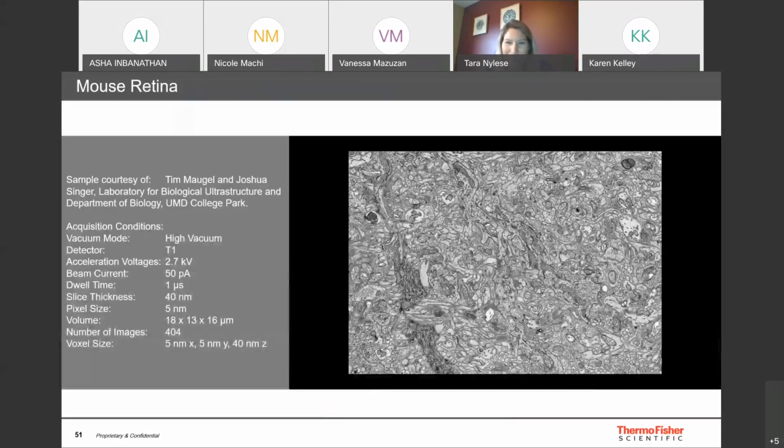Oh, I'm sorry, unless you squint now. Normally I have a zoom in, but it looks like that didn't activate. So zooming in onto the area, you could actually see the ribbon synapses that are really down at the 5 to 10 nanometers size for those features themselves. And the one of interest, I think, is right here in the middle.